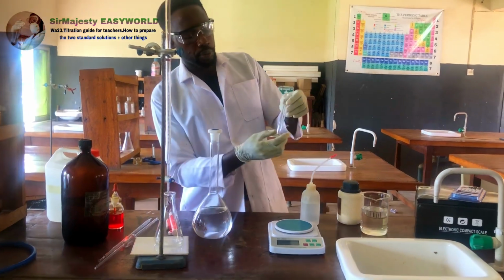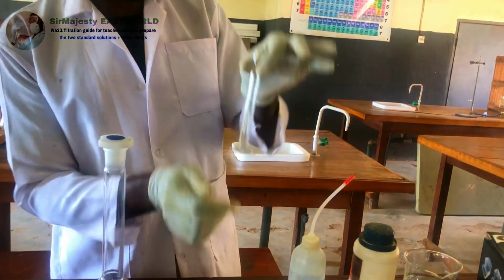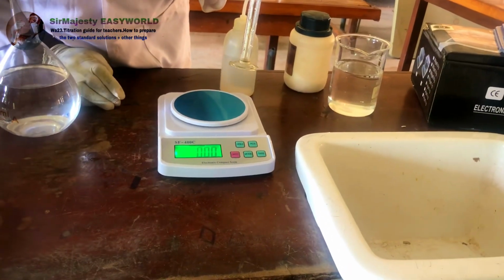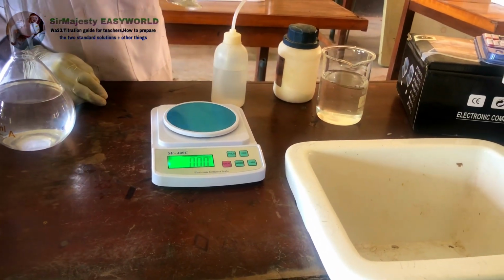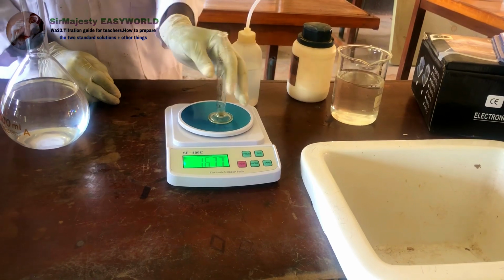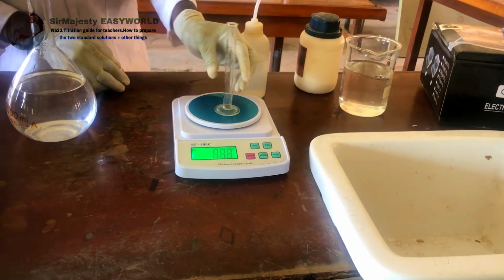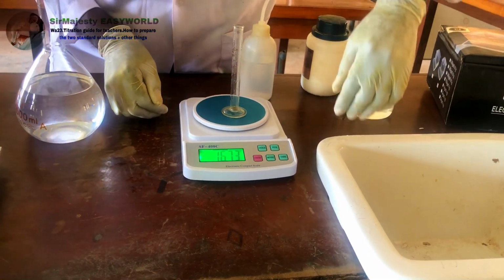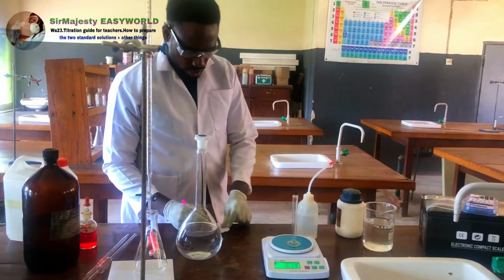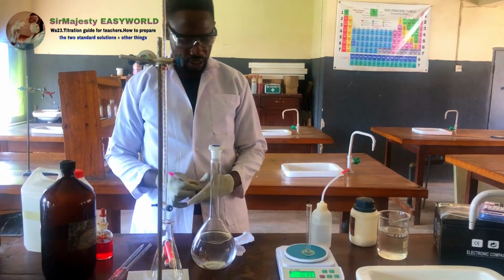So you have to put a known volume of this and measure. First, I need to know the mass of this particular cylinder, which is what I'll do now. Let me know the mass of this cylinder alone. Let me try to dry it very well, but the water there is insignificant. Okay, from here it reads 16.73. That's the mass of the cylinder alone. I've taken record of it.